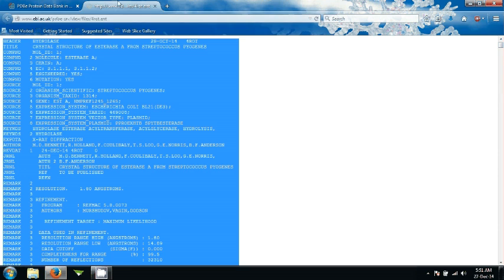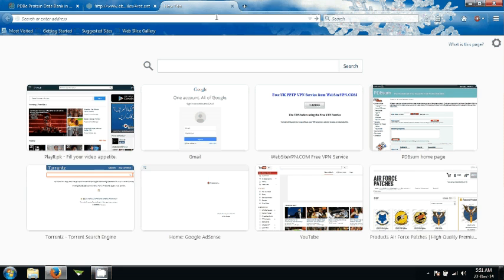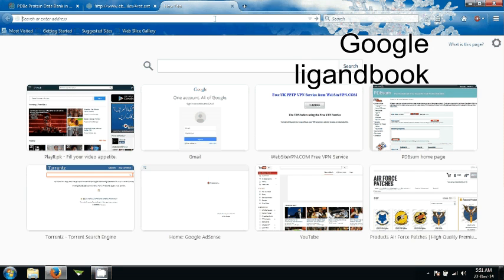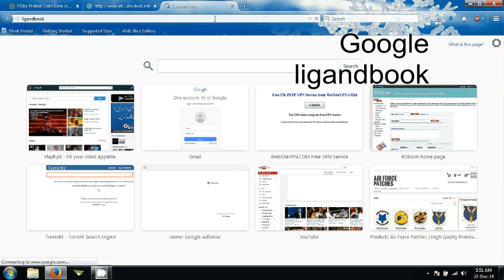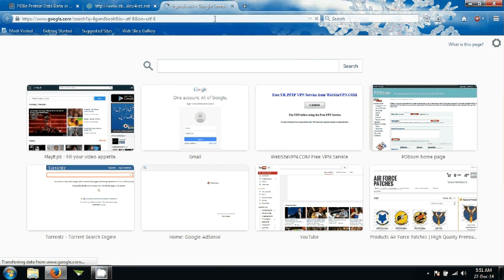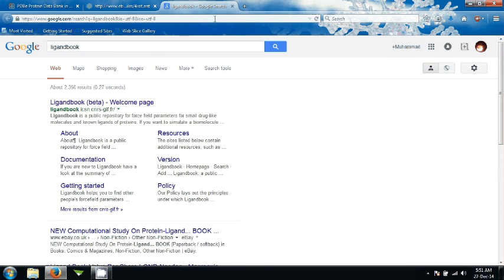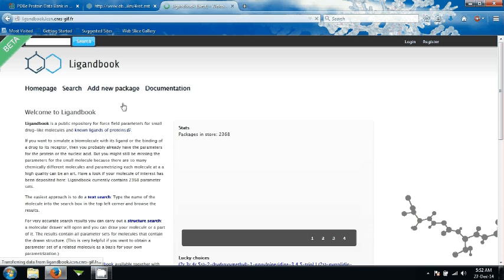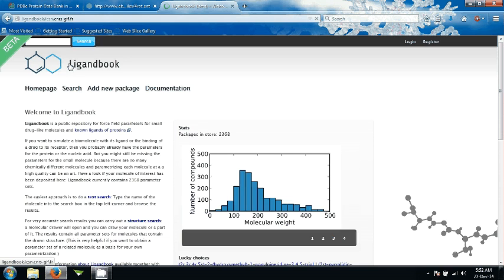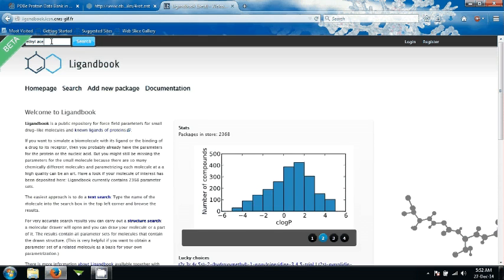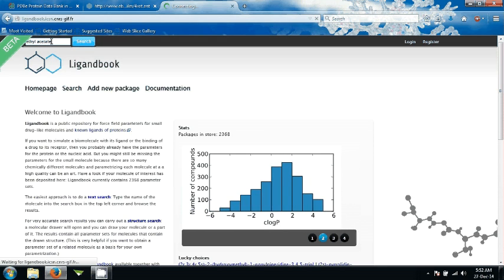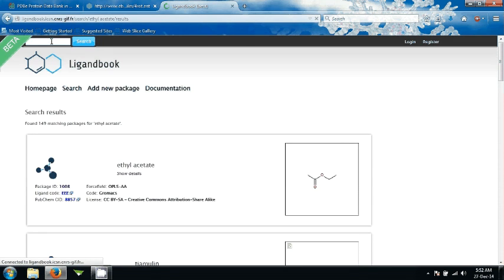Next thing is that you need to find the ligand. In order to do that, Google ligand book. Here is ligand book. Go ahead and open it. It has opened finally. You need to find ethyl acetate. Search it. This will show you this molecule, ethyl acetate.